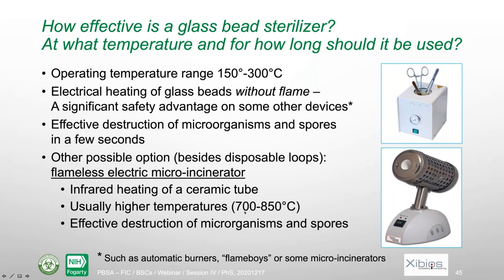It works at higher temperatures, so in this case, you might have more disturbance of the airflow. But also, it's very quick. So this type of equipment could also be used.